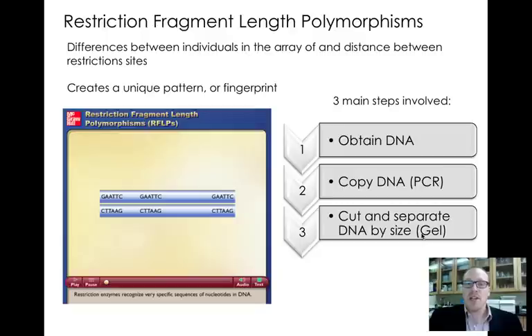This is a quick animation on DNA fingerprinting or restriction fragment length polymorphism. But before I show you that animation, I want you to know these three basic steps. To do a restriction fragment length polymorphism, or RFLP, or DNA fingerprint, you need to first of all get DNA, you need to obtain it. And then you need to, in some instances, copy it, make many, many copies of it so that you can do the next step, which is to cut it up into different sizes using restriction enzymes, and then run it on what we call a gel using a technique we call gel electrophoresis. So here's a quick animation. Take a look at this and see what you think.